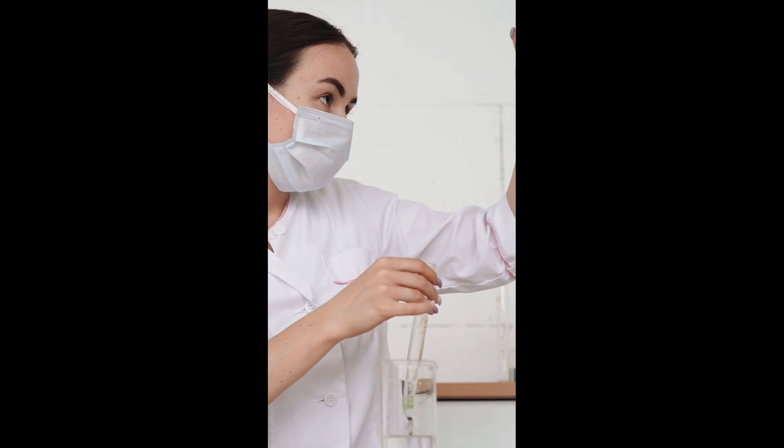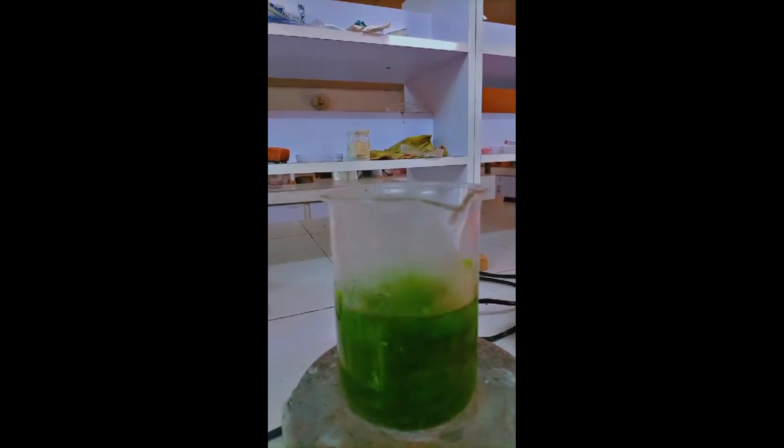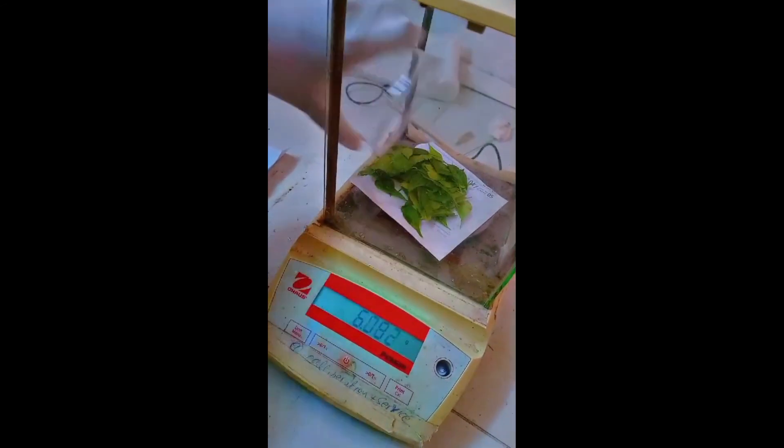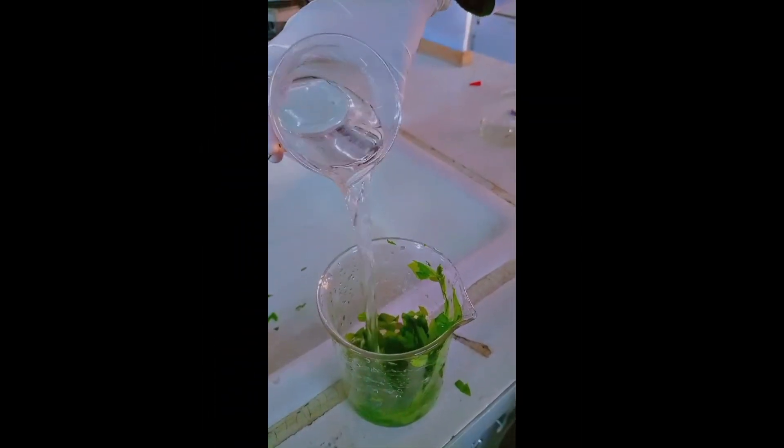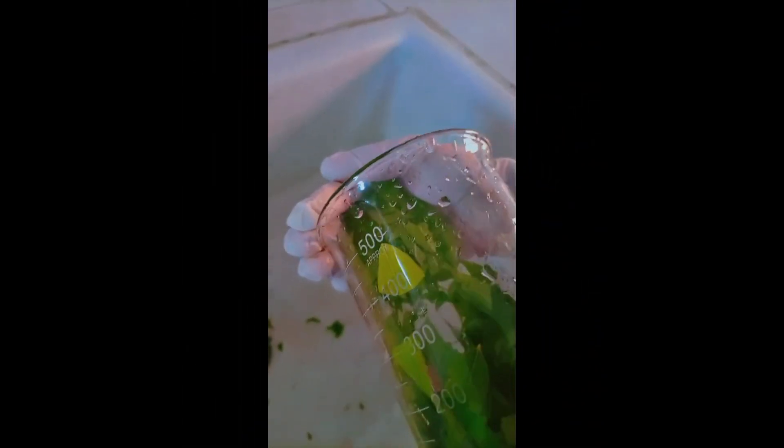First, we will prepare the neem extract. Take fresh neem leaves and weigh them accurately. Use a knife or scissors to finely chop the neem leaves - this increases the surface area for extraction. Now rinse the leaves thoroughly with distilled water to remove dust and impurities. Make sure to use distilled water, not tap water.